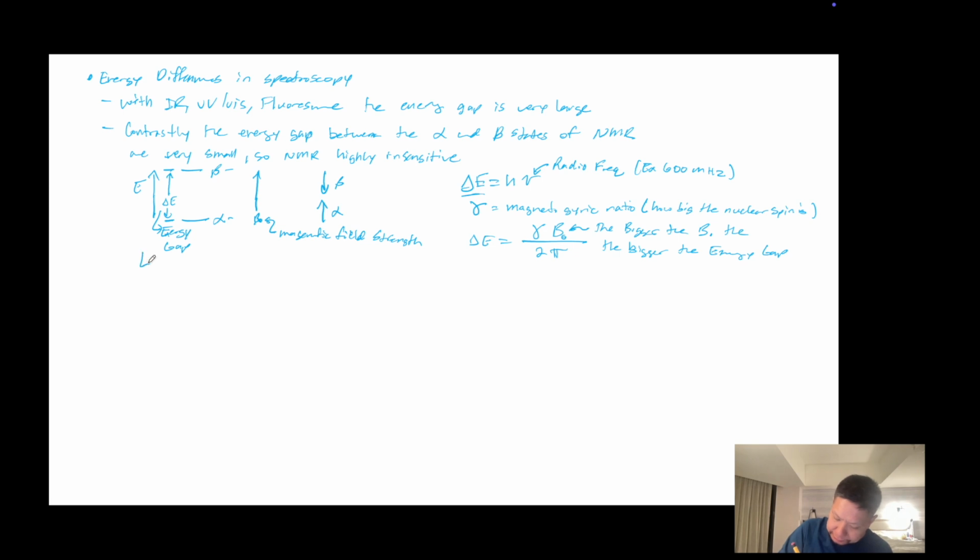Thus, the bigger the magnet, the bigger the better, right?